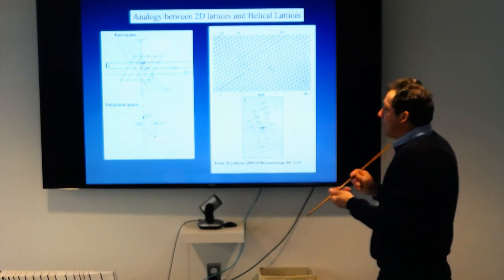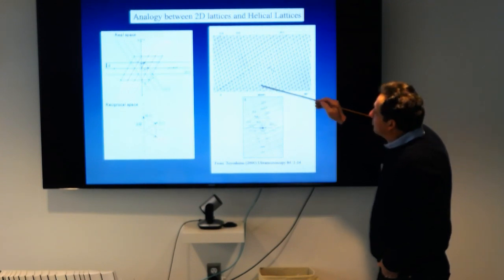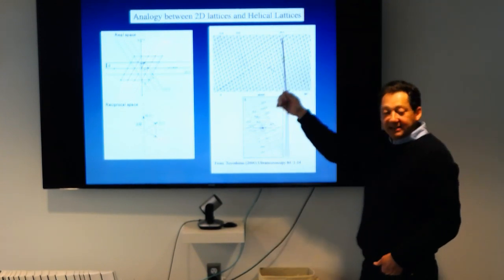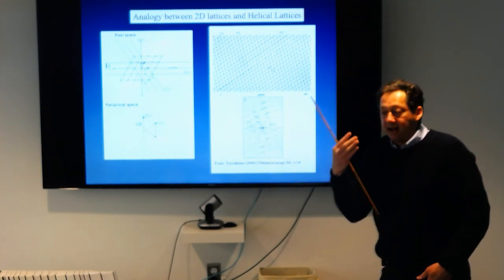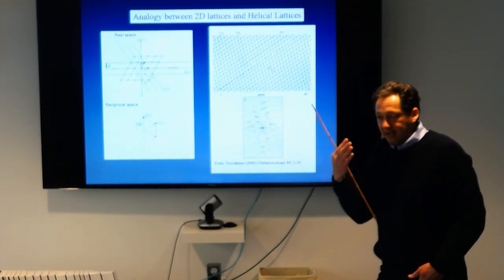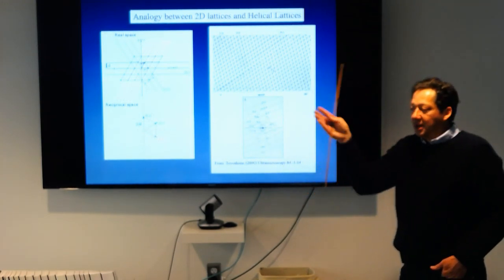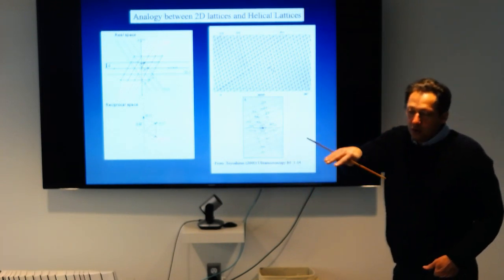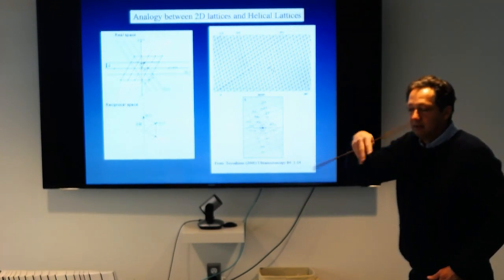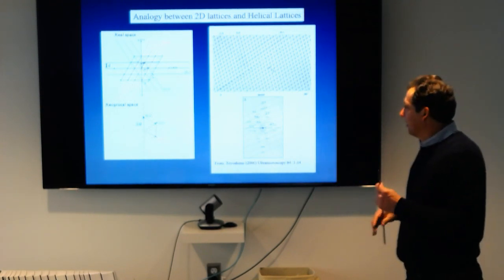And as a matter of fact, what you're gonna see here are reflections coming from the front lattice and from the back lattice. That is a complication when you are indexing the diffraction pattern, because sometimes you see a reflection in one side of the diffraction pattern correspond to the front part or the back part. So you have both of them there.